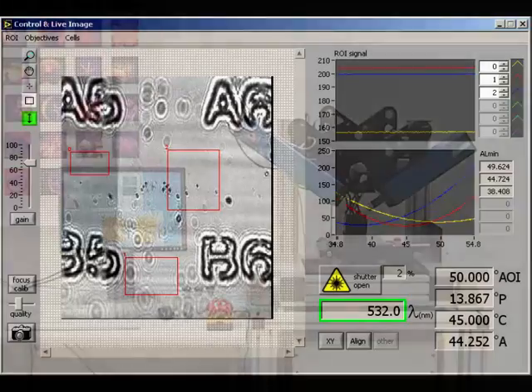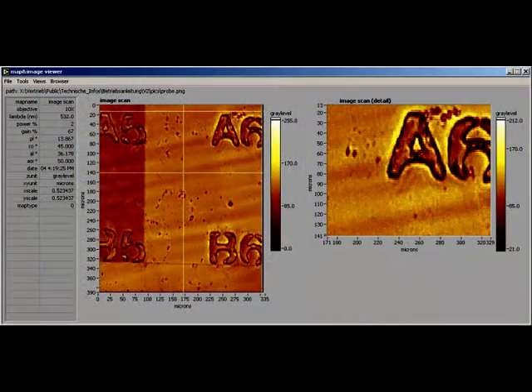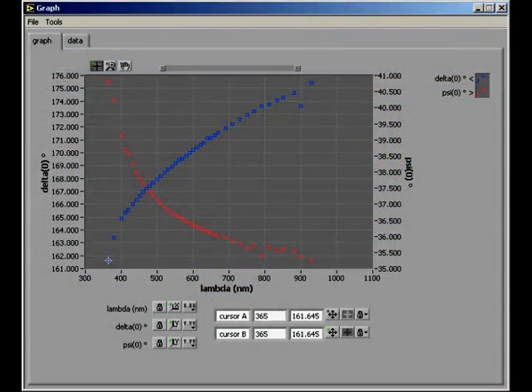All operations, including evaluation, are controlled by the EP3 View, a user-friendly and customized software.